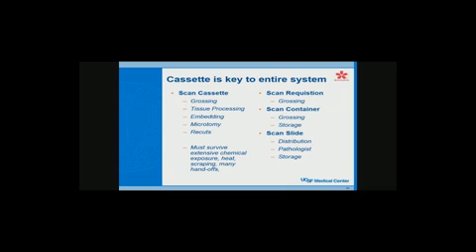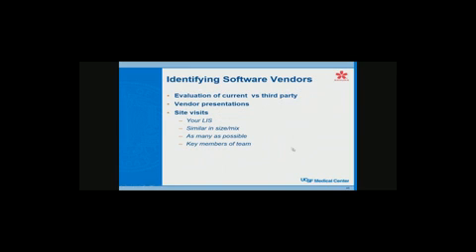The issues that come up sometimes is if the printer prints off a little bit, and we've gotten grossing staff to be looking at cassettes, that if they see any issue with the cassette, like if it's for some reason printed high or printed to the side or something, they have to reprint that cassette so we don't have a problem. Because once it leaves grossing, it has to go through all these other steps. If there's a problem at any step, it's going to stop. And you're going to have to do manual entry, or at some points we'll do re-embedding. For instance, at embedding, if they can't get the cassette to scan, we'll print a new cassette right then before they embed it. That way we'll have a good cassette throughout the rest of the process. It's really important to do that because you've got to use it all the way through.